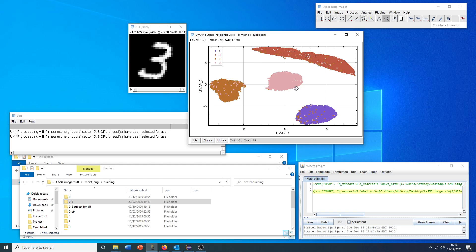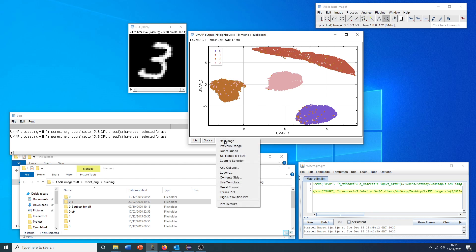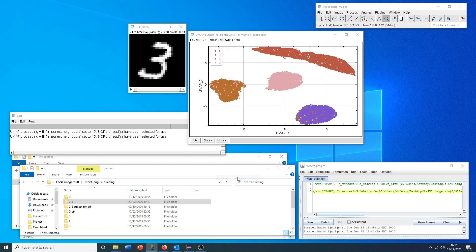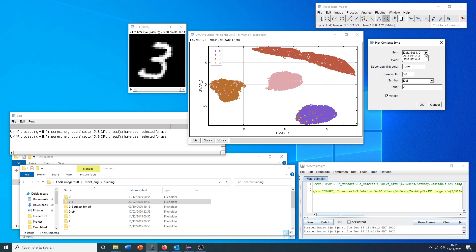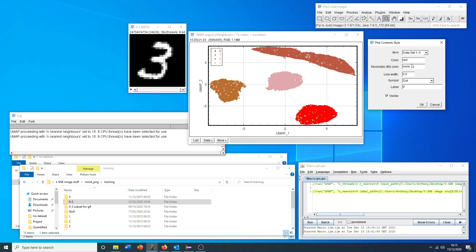In this case, the labels, because they could be strings, were pulled from the file. But we can just say auto here and voila. This coloring is random. So occasionally you might get two very similar colors presented on screen. I'm not here to show you all the features of ImageJ, but you can just change that by going to content style here. Picking your group and then selecting another color. Here this is hexadecimal, but it accepts some plain text numbers as well. Here we can change that to red, for instance.